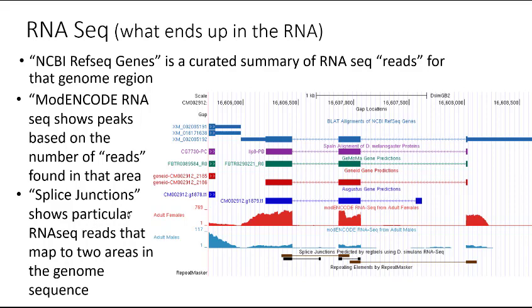There are a couple of different tracks on the Genome Browser that tell us about RNA-seq data. First of all, there is this top one called the NCBI RefSeq genes. This is actually a curated version of the RNA reads that are from this particular species.